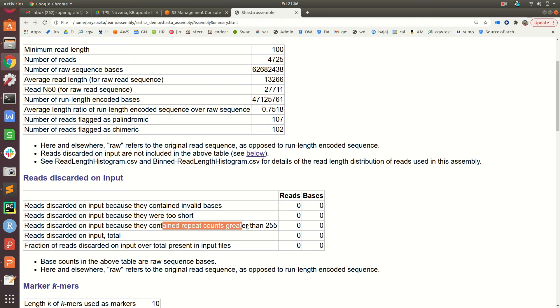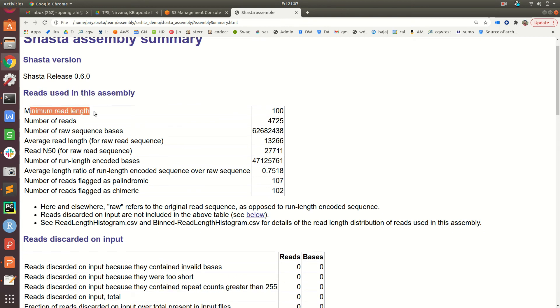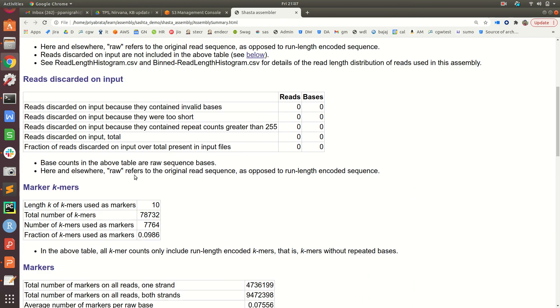Reads can be discarded for three reasons: invalid bases, reads that are too short, or repeat counts greater than 255 — which would increase the complexity of the assembly process. In this example, with a minimum read length of 100, all 4,725 reads were used. The total bases and average read length were reported, with an average read length of around 13,266 bases. The read N50 value was found to be 27,711, and the summary also flags how many reads are palindromic or chimeric.